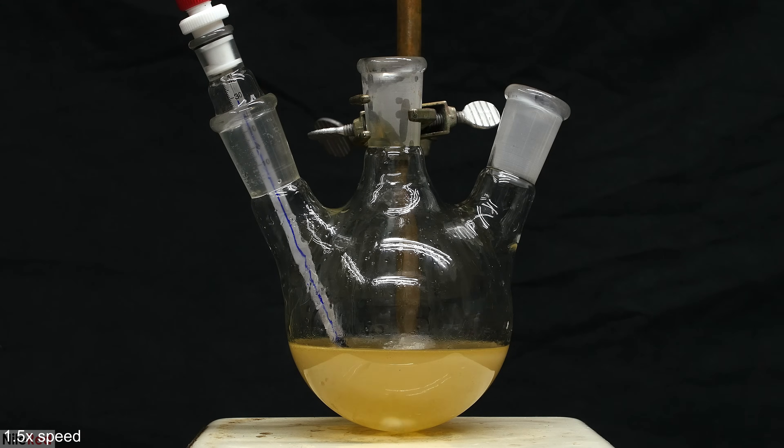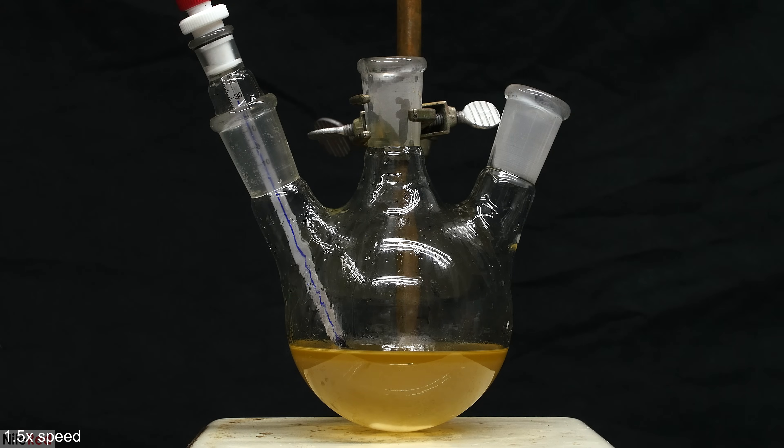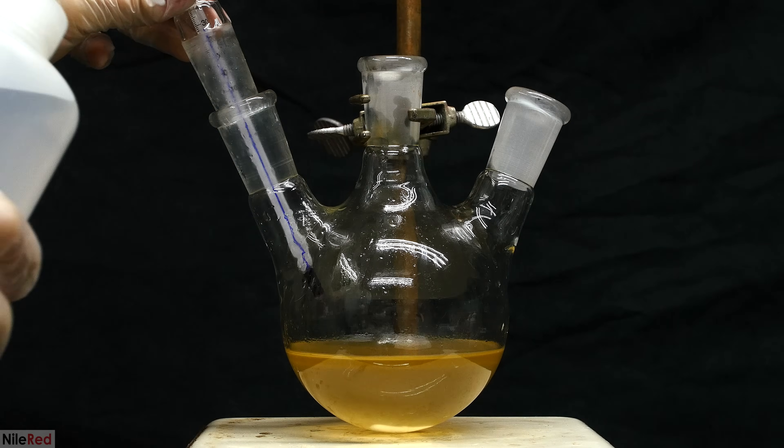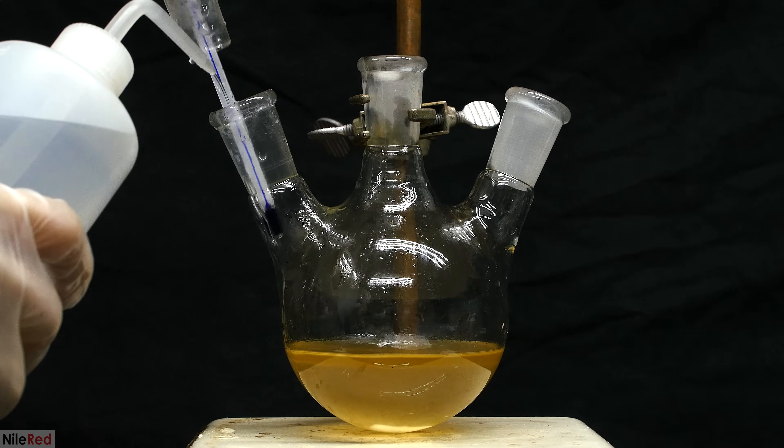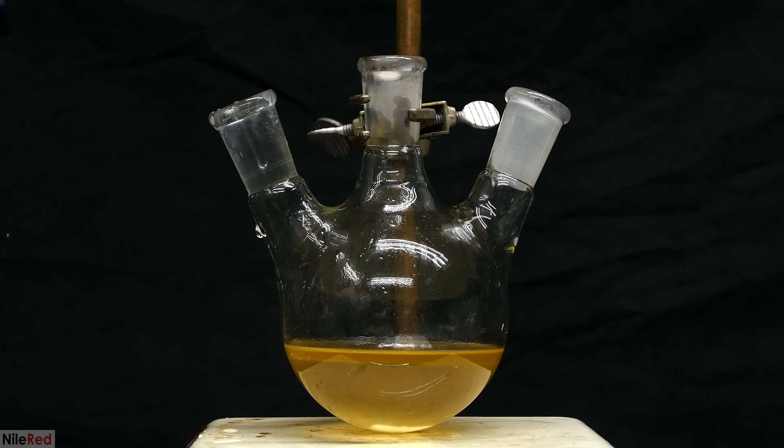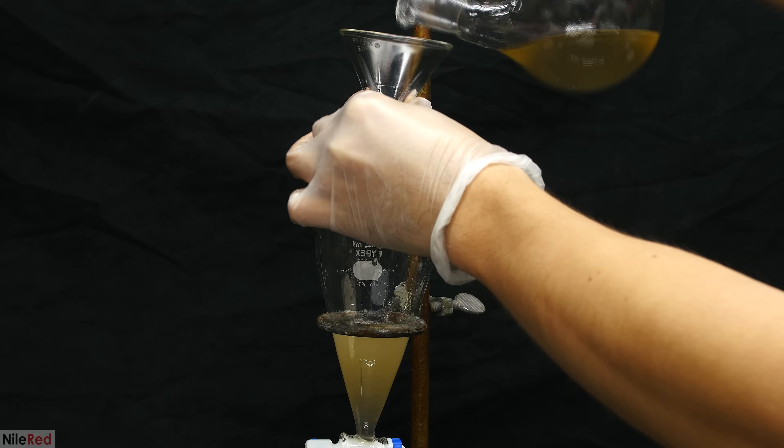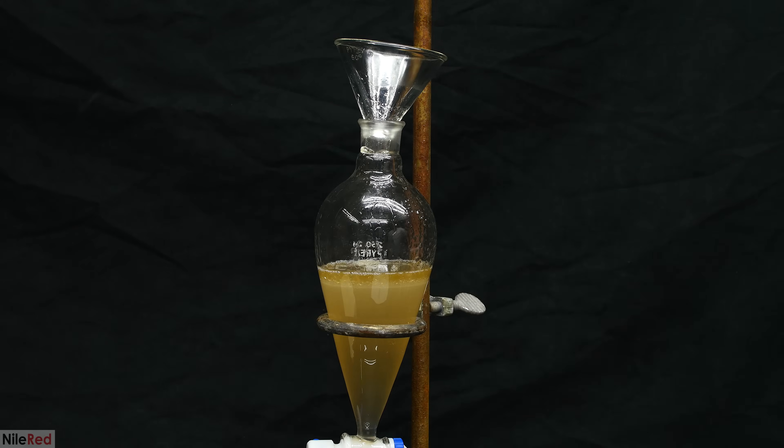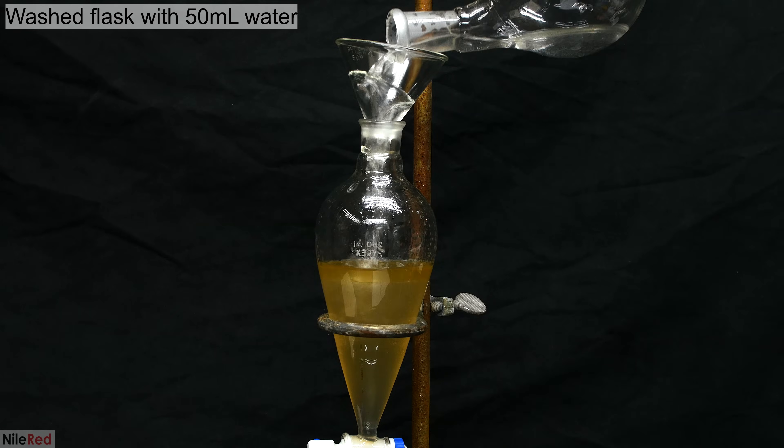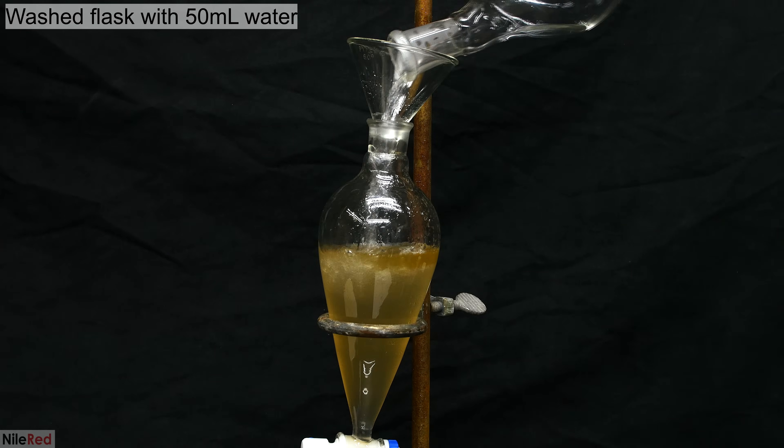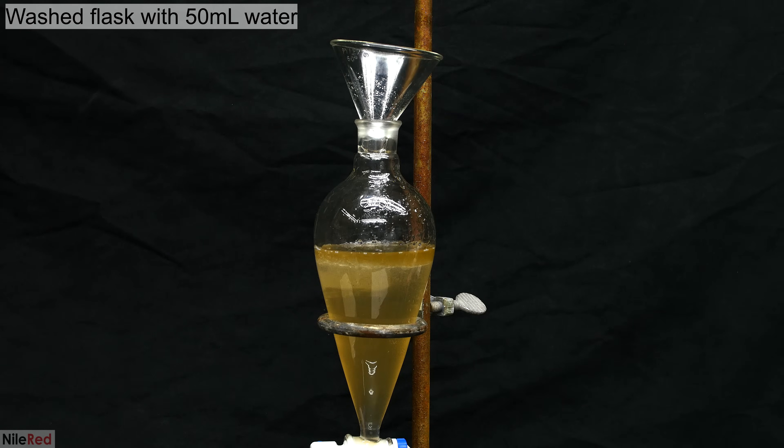Once all the sodium iodide had dissolved, I turned off the stirring, and we can see that things separate into two different layers. As I said before, anisole is less dense than water, so the upper layer here is our desired product. Before moving on, I take out the thermometer and I rinse it with a little bit of water. Everything is then poured into a separatory funnel. The round bottom flask is washed with about 50 milliliters of water, and this is also added to the separatory funnel.